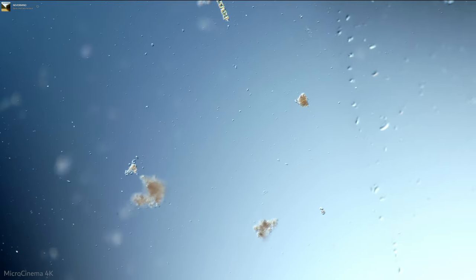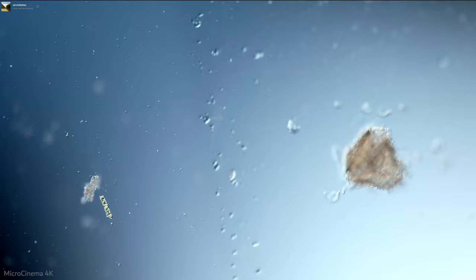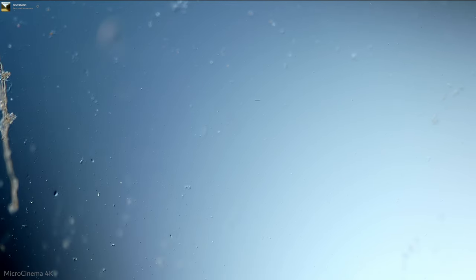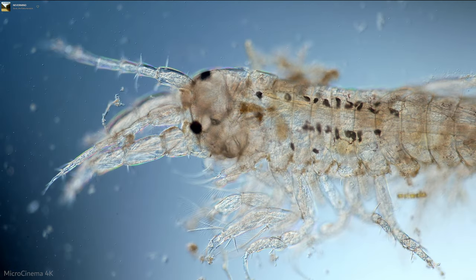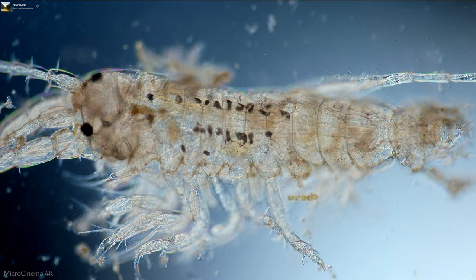And then Marcos asks about encoders, and yeah, this is something I had set up a long time ago, actually. I basically had magnetic encoders, linear encoders, so that I could always know what position I was at relative to like the corner of the cover glasses. Usually I would basically go to the corner at the beginning of the stream, and then we would see, here's one of these like looks like praying mantis shrimps, and it's not a mantis shrimp, but it kind of looks like a, got the two big feelers there. But yeah, having the encoders is really nice, because if you see something that's interesting and you want to go away to chase something else, but you might want to find that thing again, you can just always know where you are.